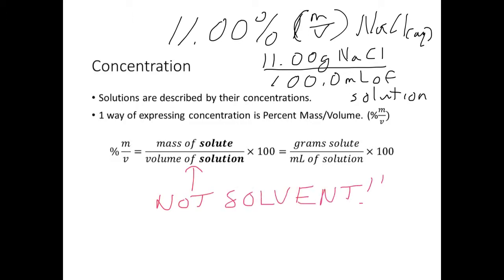Not the volume of the solvent, the volume of the solution. That is going to have a very important role in how we make solutions in the laboratory, so it's important that you realize that distinction. One of the reasons we stress that distinction is, matter of fact, let's talk about how we'd make a solution.